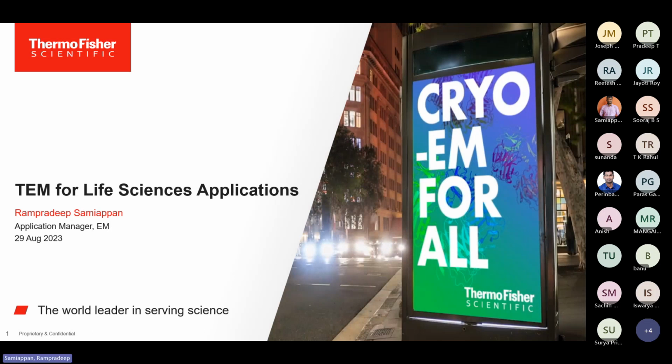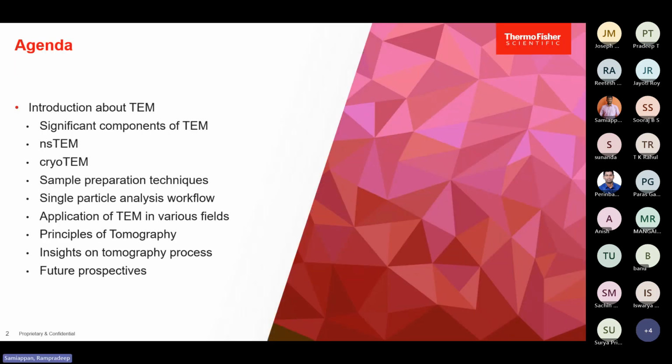And with that, I would like to start my presentation. In the next few minutes, I will try to cover information regarding transmission electron microscopy and the main significant components of the TEM electron microscope. At least the first 10 slides will be the introduction to EM, considering the general audience over here.